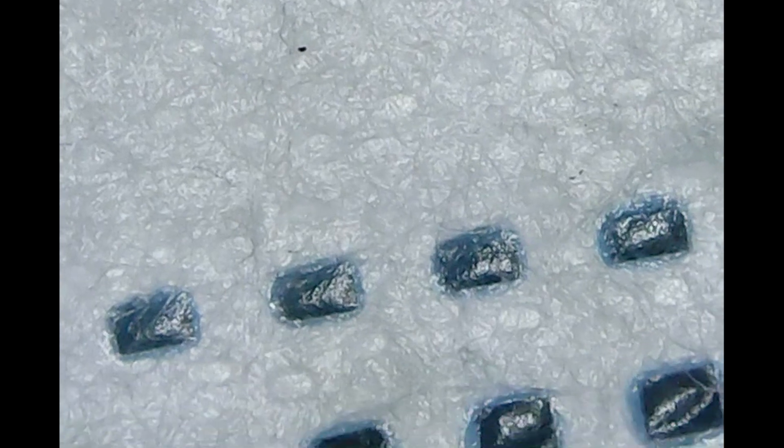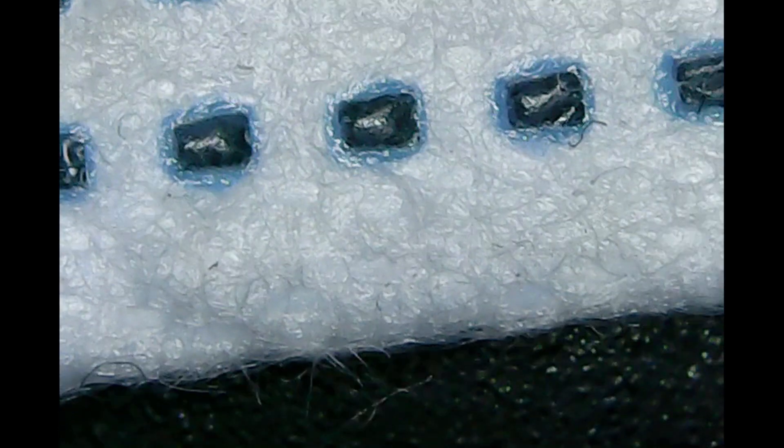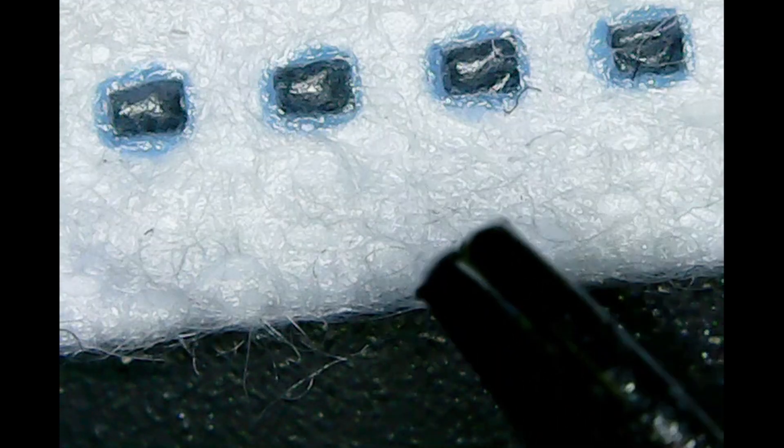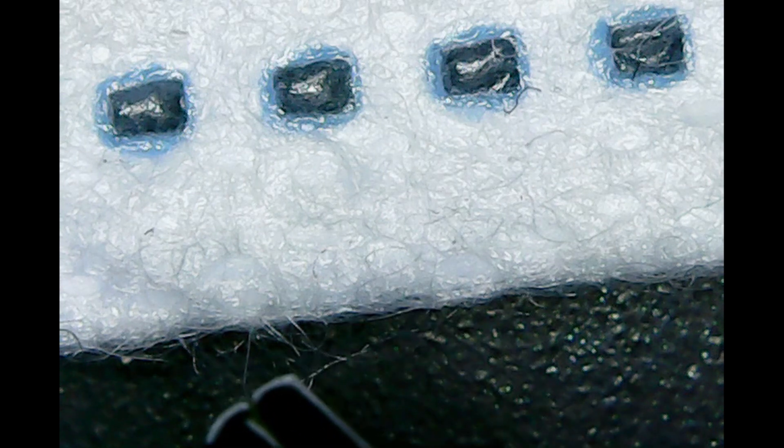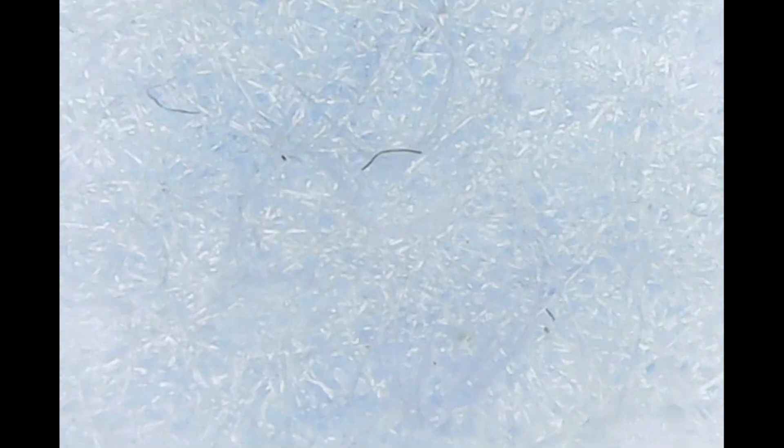I'm gonna move it to the very end. Let's see. There you go. Yeah look at this part here. It's very hairy. Check this out. See how dirty it is. I'm sure it happened because I was touching it a lot with my fingers.